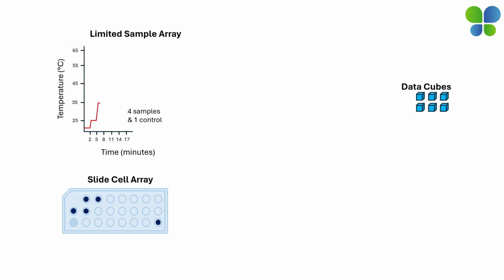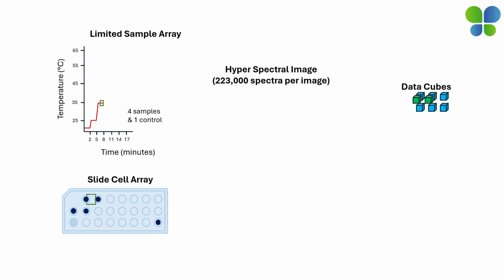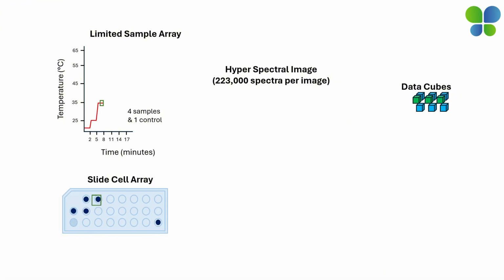significantly enhanced. This real-time hyperspectral image acquisition method is performed under accurate thermal control for a multiplex of samples using an innovative slide cell array, with a fixed path length allowing for comparability assessment of the intact therapeutic protein, which streamlines the workflow and limits variability in the results.